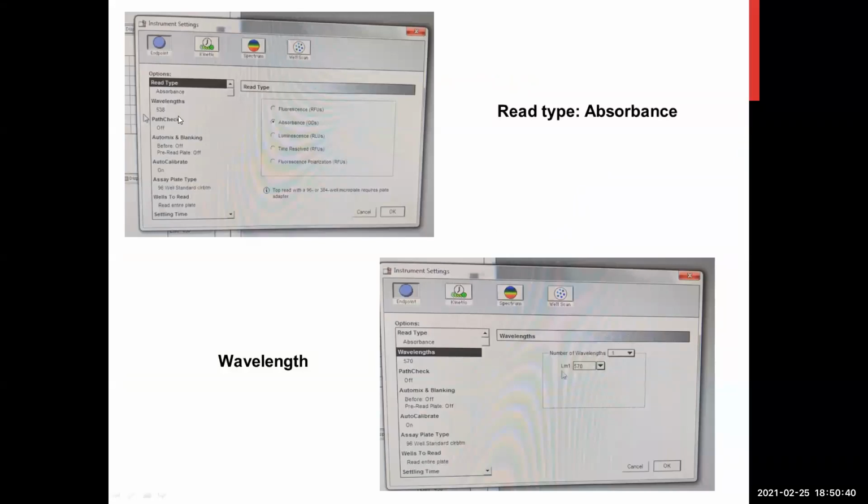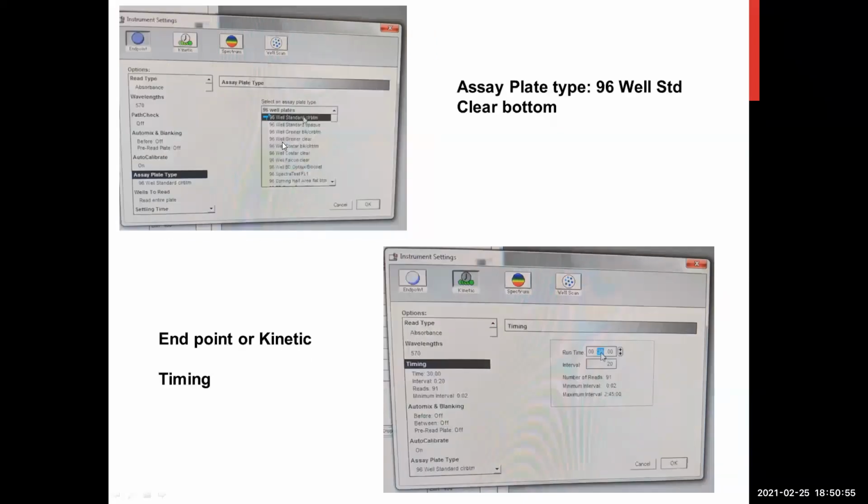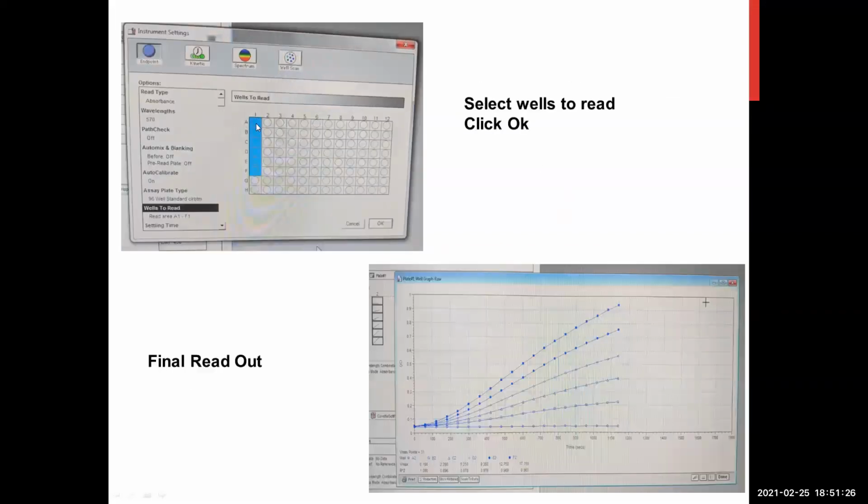If you are setting up a colorimetric assay, obviously the read type is going to be absorbance, and then you would select the appropriate recommended wavelength for that particular assay. You can also select the 96 well plate that is going to be used for measurement. And for colorimetric assay, please always select a clear bottom, clear 96 well plate. Depending on what the protocol calls for, you can use an endpoint mode or a kinetic mode for measurement, and based on that, you can choose the timing of measurement as well. Then at the end, you would select the wells to read, click OK, and this is how a final readout would look for a colorimetric assay.